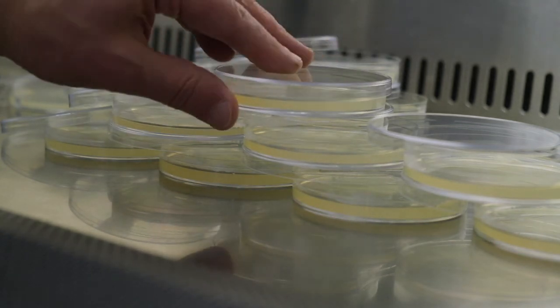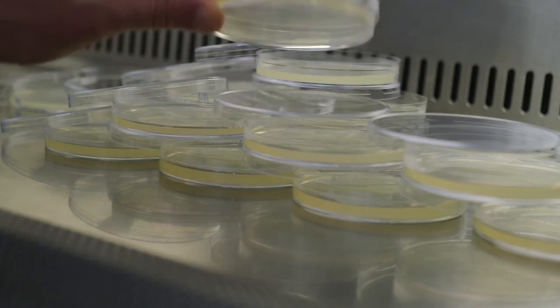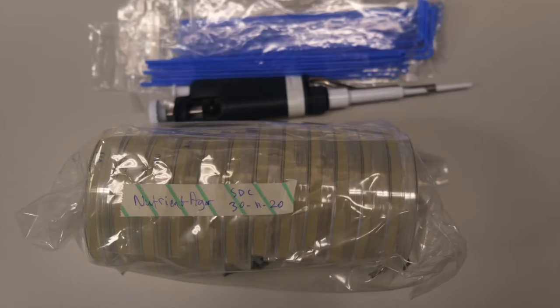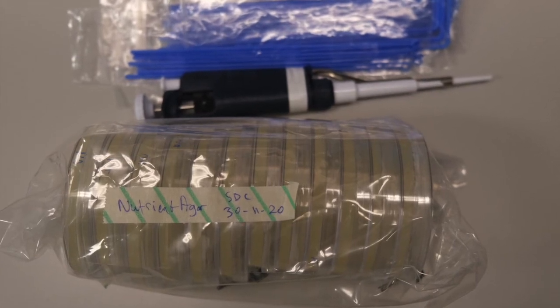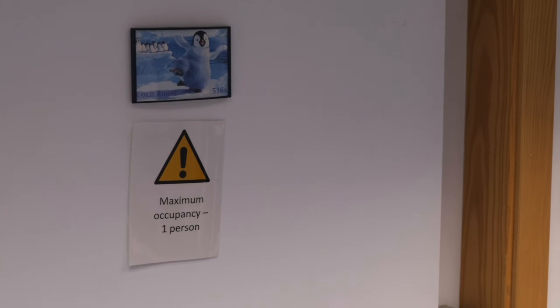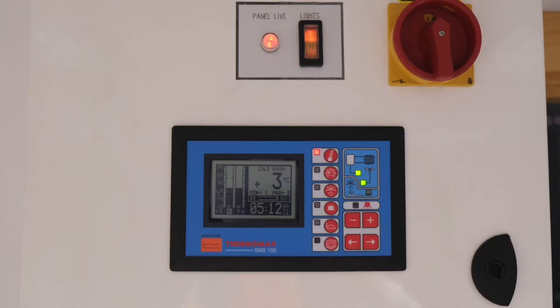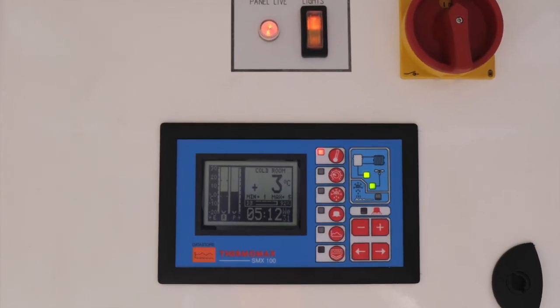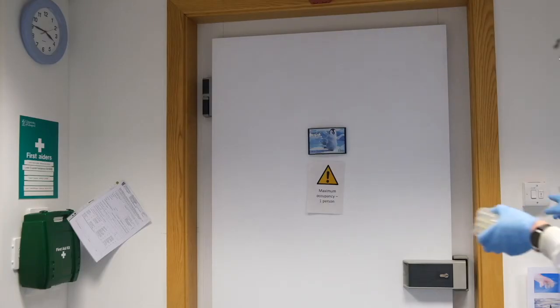We can put a lid on and turn it upside down and it will remain in the plate. We can put our plates in a plastic bag and put them in the cold room. Here they can be stored at 3 to 4 degrees centigrade for up to one or two weeks.